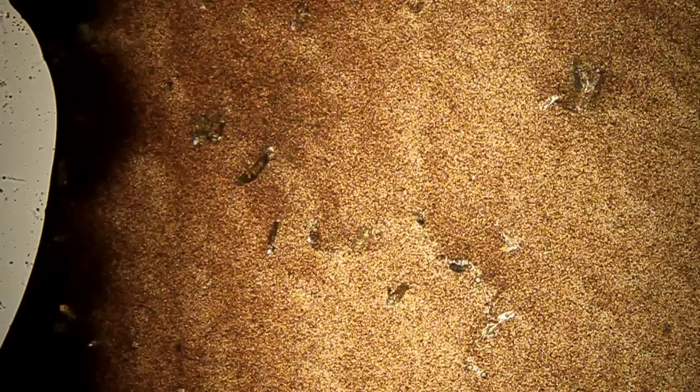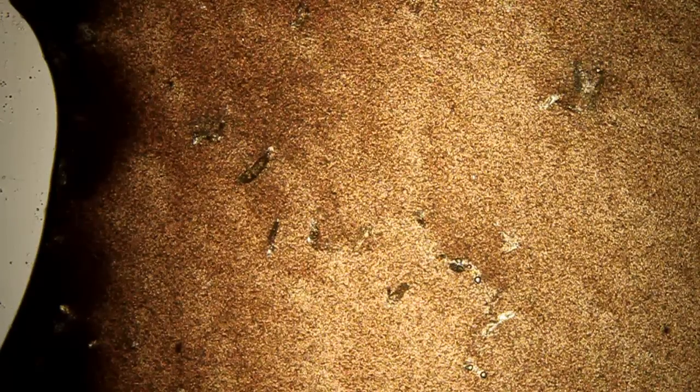I have no idea what this other stuff in here is. I don't know what the dark things are. It's definitely in the blood though. It came with the blood, it wasn't on the slide.